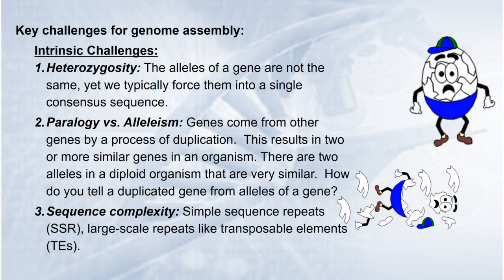Now, for the challenges that we will encounter, just to prepare you, we talked about these a little bit already. And this gets to the Humpty Dumpty problem, which is probably the most important. One is that there's heterozygosity and sequencing errors that exist. These are major intrinsic challenges.